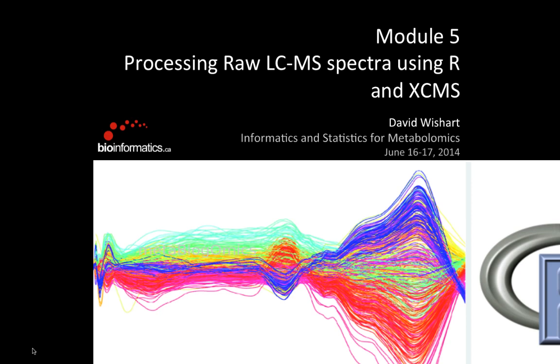So again, this is the R logo and XCMS, and people tend to use this beautiful graph. It's usually generated after we align all the spectra and generate a deviation plot. Today we are going to try to generate a similar one, but much less dense, but we are going to have one graph like this.